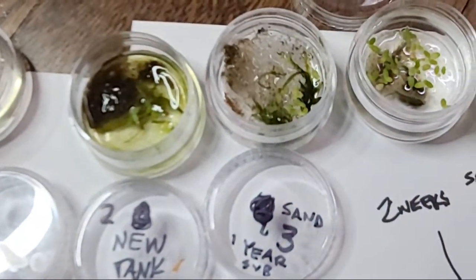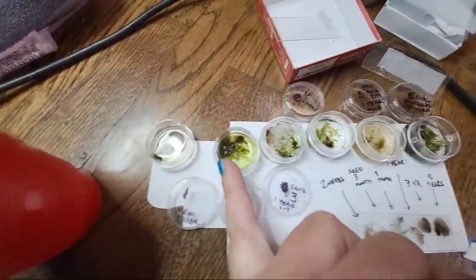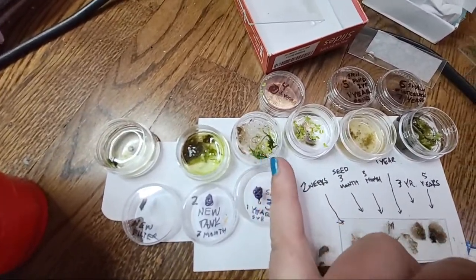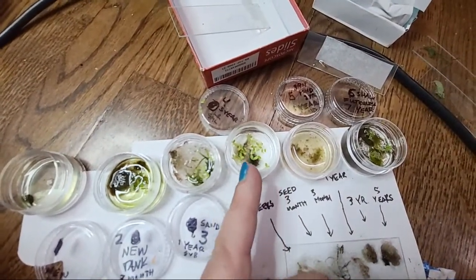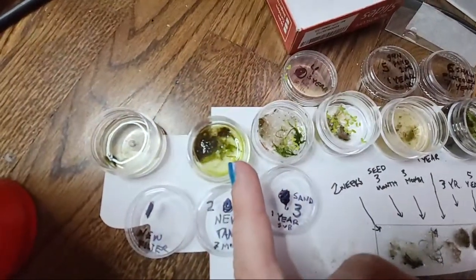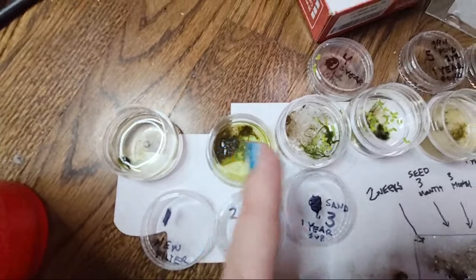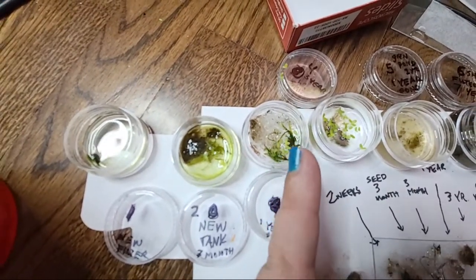We didn't see a ton of little microfauna, but this is filter floss — the water is very different. When we scrape surfaces and get cultures we know these correspond to each of the tanks that I took the filter samples from, and we know for a fact that these have all sorts of critters living in them from this week's microscope sessions. There's that female that we saw the eggs on — that's how big she is. Yes, you can see it with the naked eye, those eggs and her shape, but she's still pretty darn small. Here's a pen — she's still very small. And the male is on the glass. Here is the little male — he's smaller than the tip of a ballpoint pen, yet he took up the whole magnifying area. This is the size of life we're looking at, just to keep things in perspective.